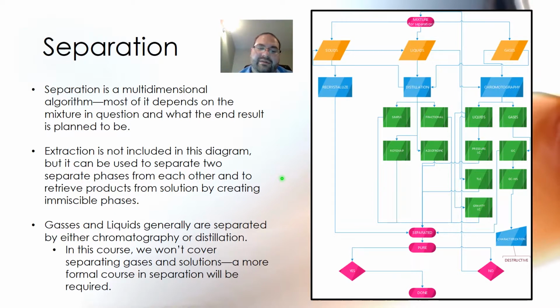Pressure chromatography methods can be a little bit more difficult to work with. It's not quite like a GC. You have to look at the pressure gradients and things like that when you're calculating the retention times. And for most of those setups, you have to run the experiment. You can't just set it up. You have to run it and get some numbers so you know what you're looking at for each specific case, because it's not always clear cut, and it depends on the setup of your system and your solvents and different things.